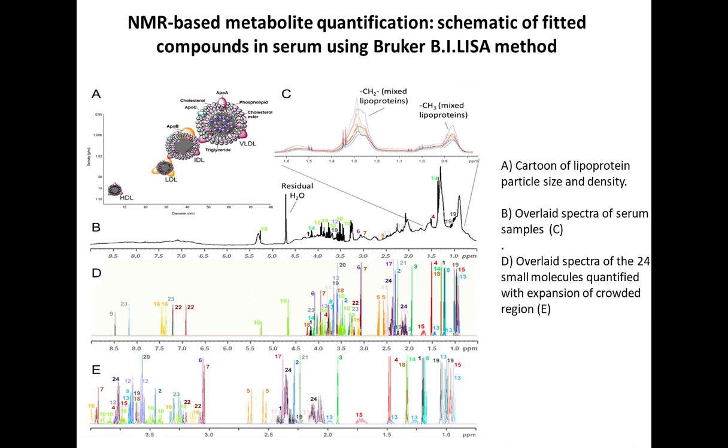molecules. And the slide we're showing here shows on the top panel, C, that the lipoproteins are calculated mainly from 2 regions of the NMR spectrum, which involves a complex deconvolution of those peak shapes. But from those, we managed to get accurate decomposition and values on the lipoproteins.